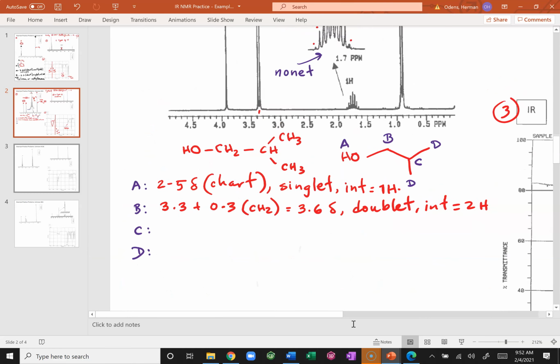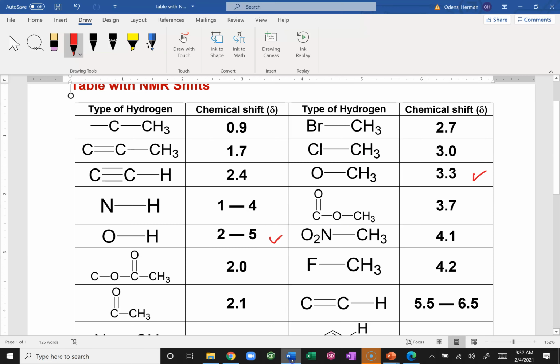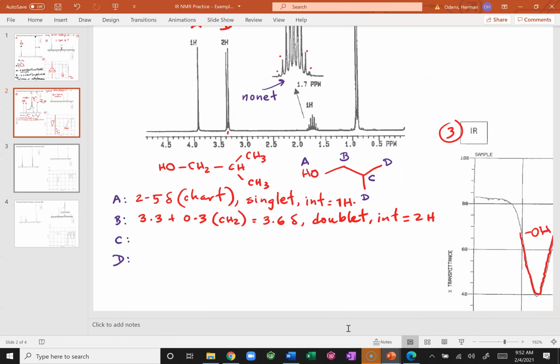All right. So C is a CH. It starts where? Here in the chart. Anybody? 0.9, yes, because the C is connected to B, which is another C. So that'll be excellent. 0.9 plus what? 0.7 exactly, because it's a CH. Does it have a beta group?